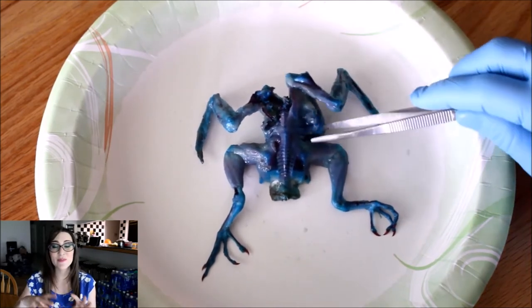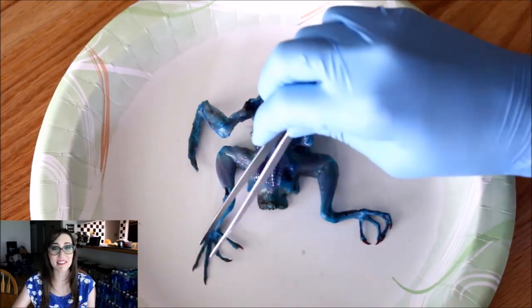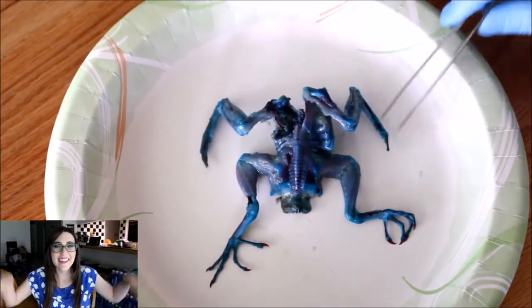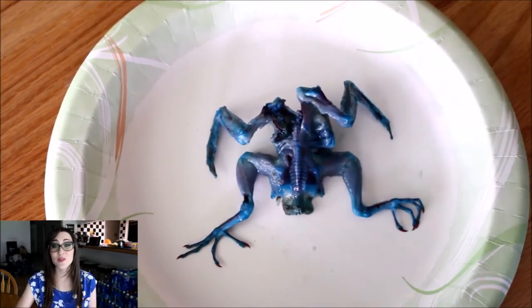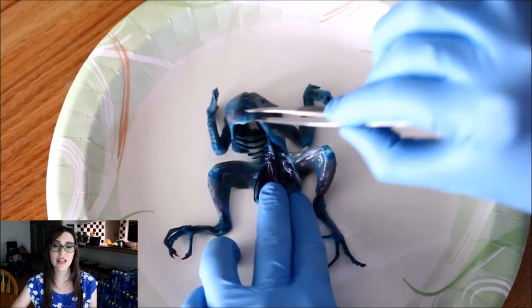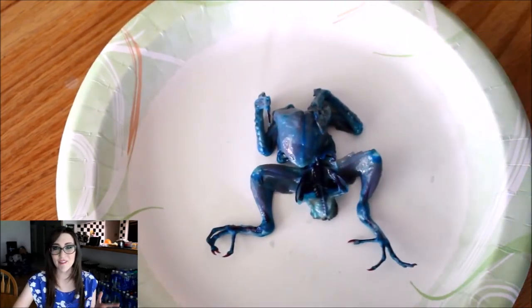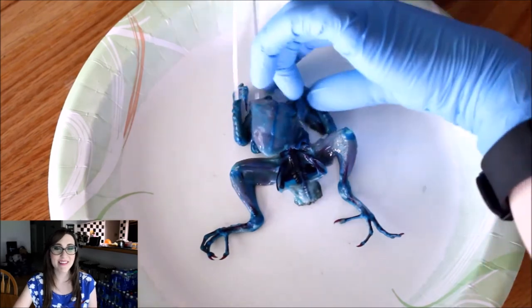On one side of the chest, you can see where the ribs are missing towards the back of the spine, and that's presumably from whenever something attacked it before it got into my hands. Spreading out the wings, you can see where the bone stain is through some of the tissues, because those did become really transparent — it looks like a little dinosaur. Turning the bird over, you can see where the spine is, which looks really cool, and you can see the back of the hip bones, which also looks super neat. The tissues on the legs do slightly look transparent, but I feel they could have been more transparent had they been in trypsin just a little bit longer. The feet — one of them looks a little wonky, kind of all bleh, and the other one is curled really nicely. I don't know what happened there. I tried to fix it when it went into trypsin, but it didn't work out.